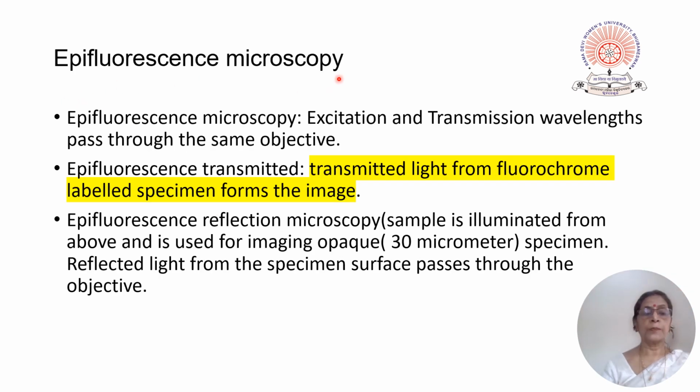Epifluorescence microscopy. When the excitation and transmission wavelengths pass through the same objective, it is called as epifluorescence microscopy. It may be of two types. One is reflected epifluorescence microscopy and second is transmitted epifluorescence microscopy.